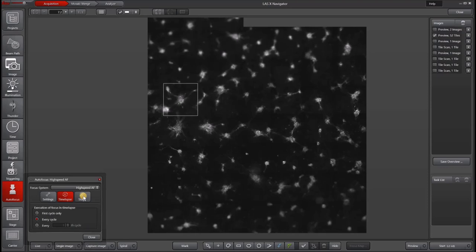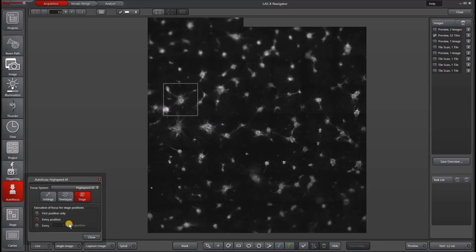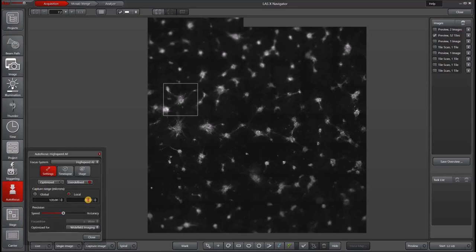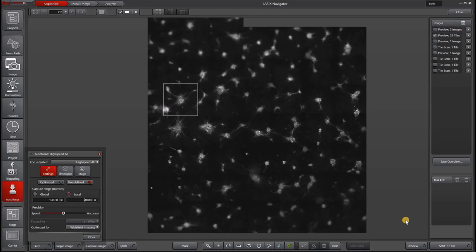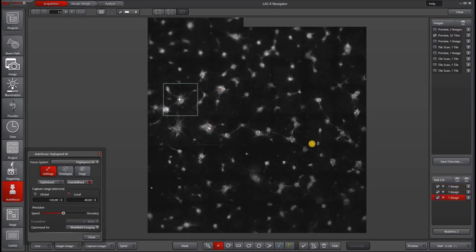Similarly, if you go to stage, you also have the option of running an autofocus on the first position only, every position or every nth position. So let's go ahead and just based on our settings, actually I'm going to increase this to about 40 microns to get a bigger range. And then I will randomly pick three areas. I'm going to put them close together just to make it easier. And then I will go ahead and hit start.